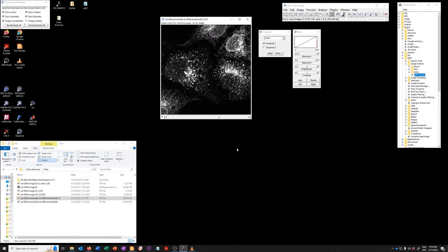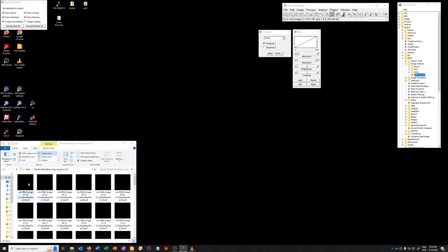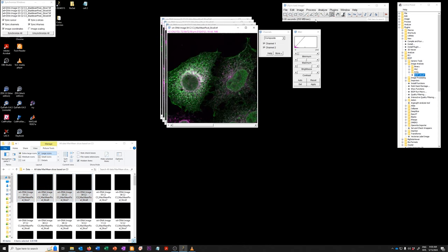So we're going to illustrate this with just 4 instead of 80, and we're going to just grab them from here, this all data max mean slices based on channel 3 folder. I'm just going to grab the first four images and drag them into Fiji.